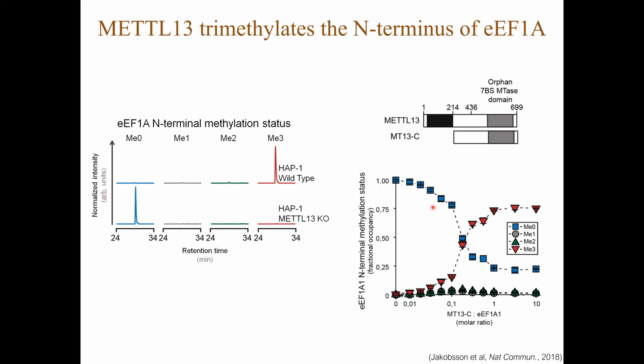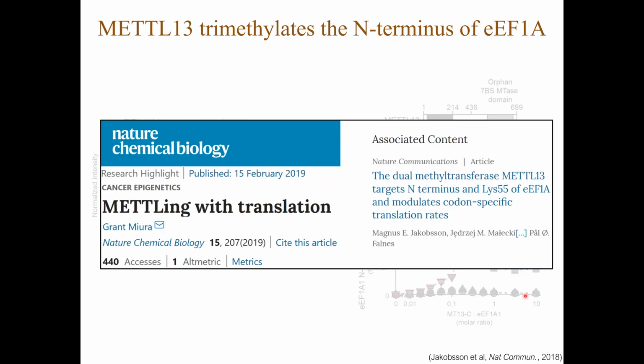You see here that it brings unmethylated substrate into trimethylated product in a dose-dependent manner. So collectively, this uncovers METTL13 as the elongation factor 1A methyltransferase, and the activity is demonstrated both in human cells and in a more simple in vitro setting. And we were also very happy that these results were highlighted in a research highlight in Nature Chemical Biology on methyltransferase-mediated regulation of translation.